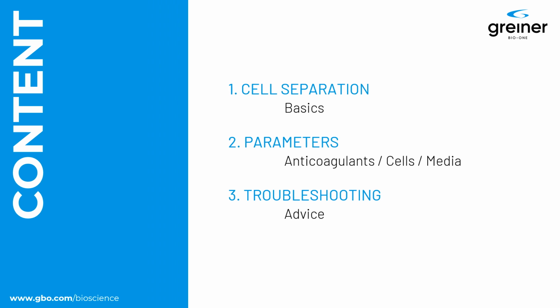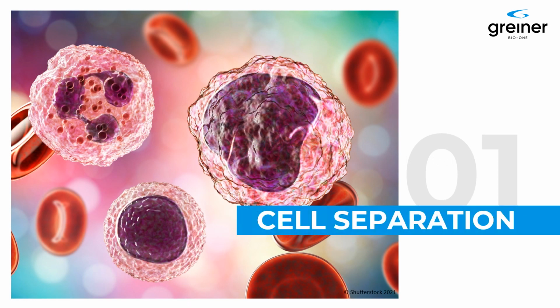In the webinar, we will address some fundamental concepts for cell separation, followed by parameters that are important to control for successful separation. Finally, an extensive troubleshooting section provides solutions for the most common problems that can arise during separation. Let's start with some basics for cell separation.